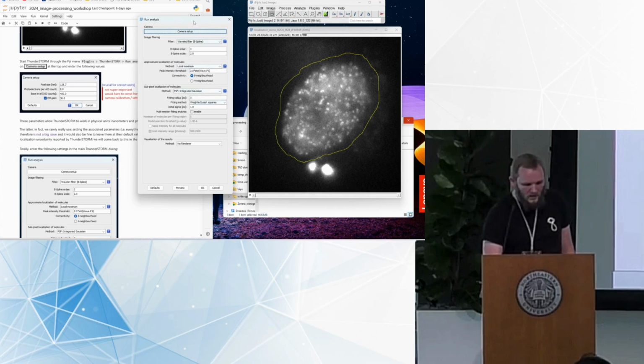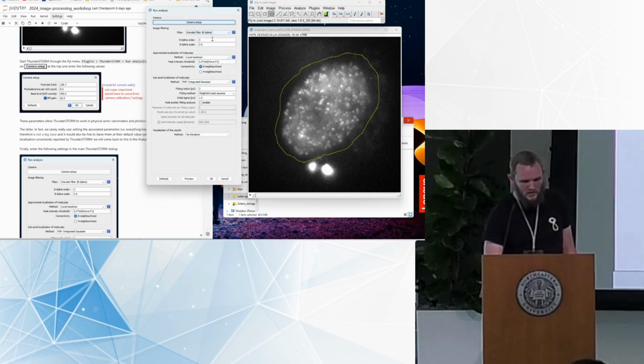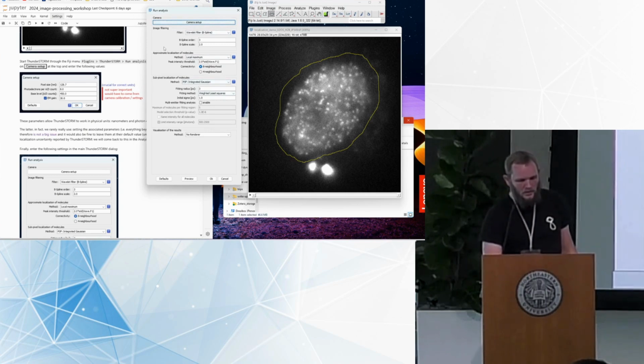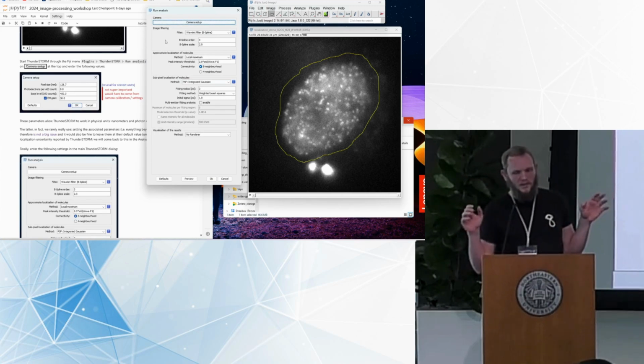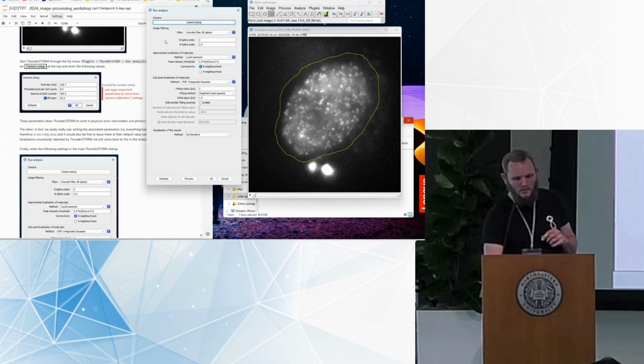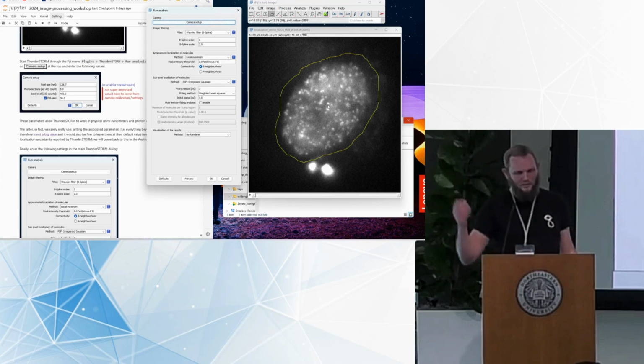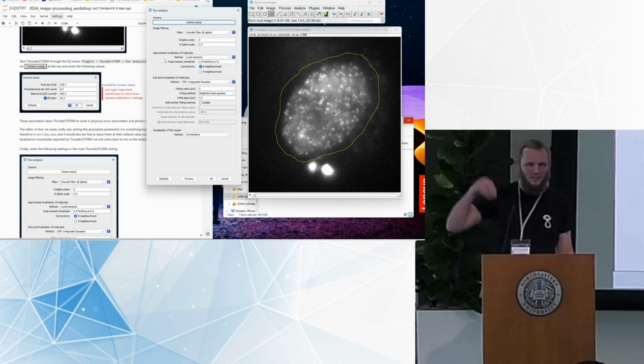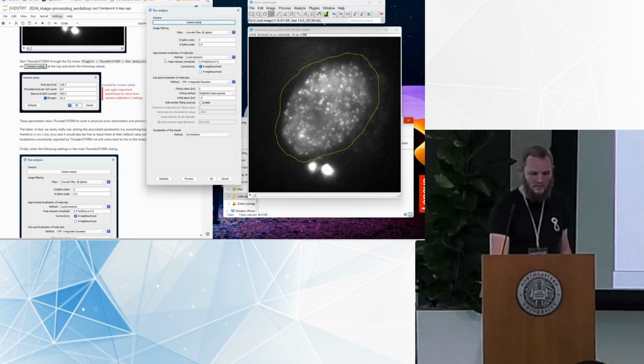And then the rest of these parameters here control how Thunderstorm looks for particles in the movie. So it basically has 3 steps, outlined by these 3 boxes here. First, it smooths the image a little bit to make these individual spots peek out nicely over the noise, and then it runs a reasonably ad hoc maximum finder on this smooth image.